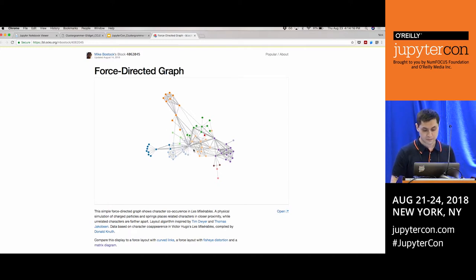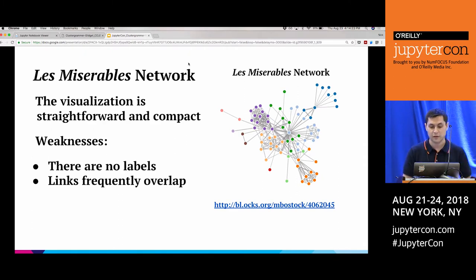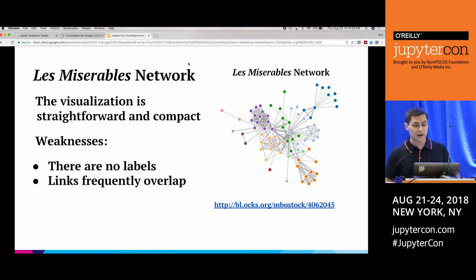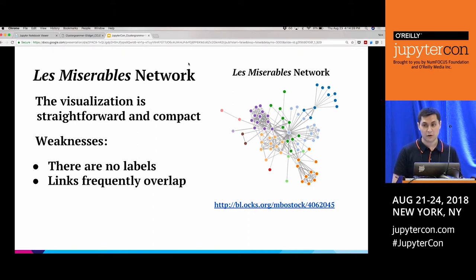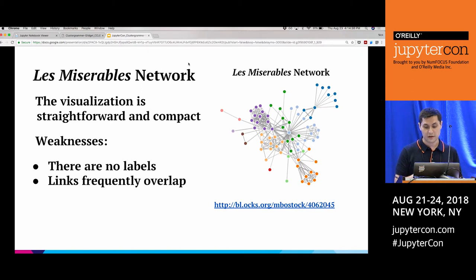This visualization lets us identify main characters like Valjean, who interacts with a lot of people, and identify clusters of characters that co-interact. It's a straightforward and compact visualization. However, weaknesses include no persistent labels — you have to hover over nodes to see them — and the links frequently overlap, making it hard to see exactly what is happening in dense areas.